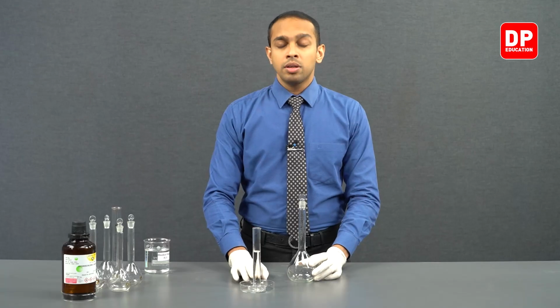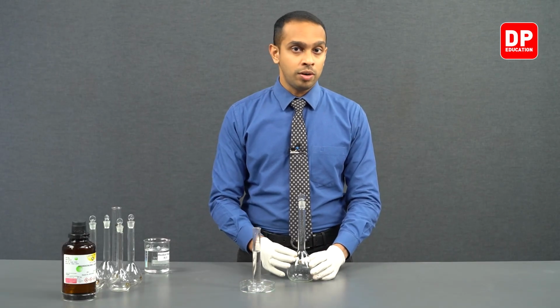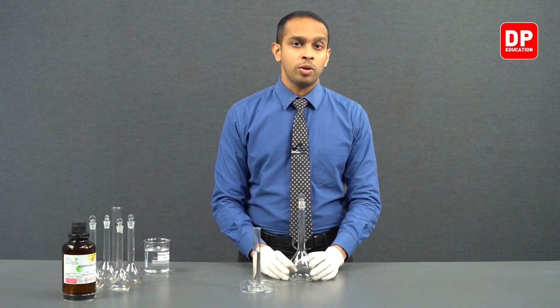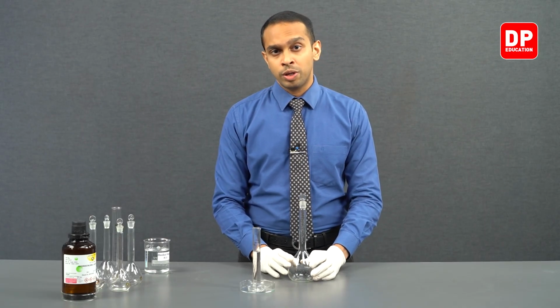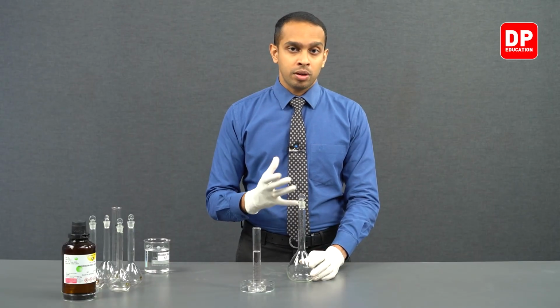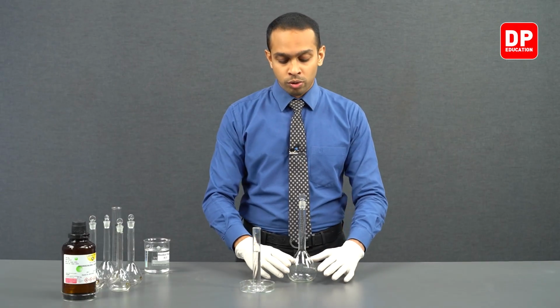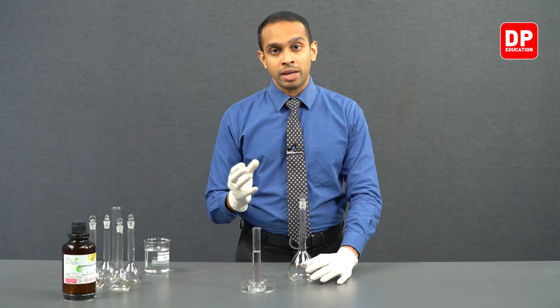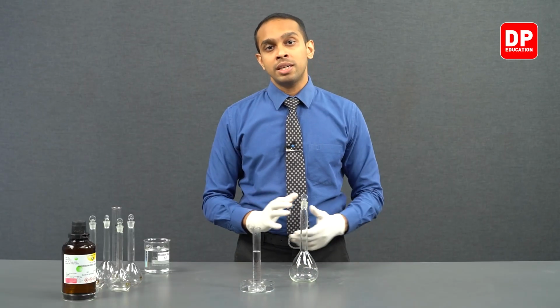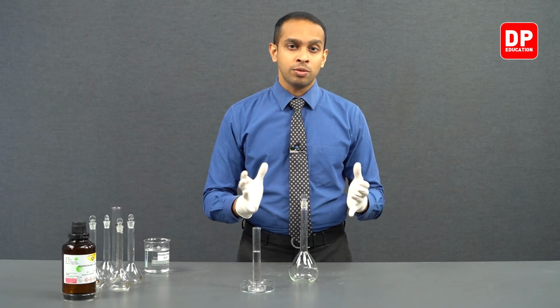And so now, students, before we add the acid to our volumetric flask, we will be adding a little bit of water into our volumetric flask, because when you are adding water to the acid, it could be quite exothermic. But if you have a larger volume of water already present in the volumetric flask, and you are adding acid to water, the heat released when acid is dissolving in water will be absorbed by a larger volume of water.